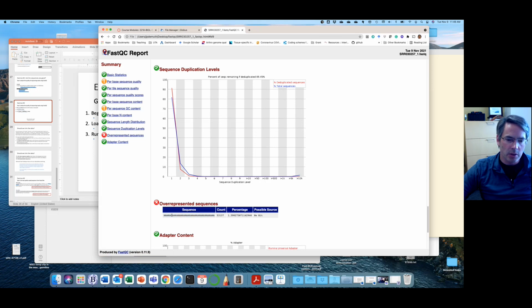The thing about overrepresented sequences, when you see something like this, is you don't know where it came from, but this is not a case where I would be overly worried, because when we go to map, this is not going to map to the genome unless there is a sequence like that in the genome, which seems really unlikely. How much work you go to eliminate a case like this depends a lot on the exact experiment and what you're trying to do.